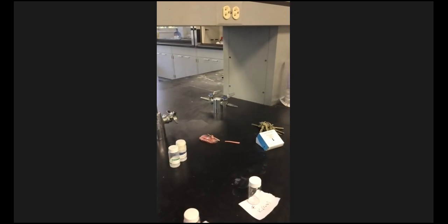It's pretty clear at the top, so I'm going to take some of that. It says take 1 ml of supernatant. I need another dropper. Let me grab another dropper. Give me 1 second.